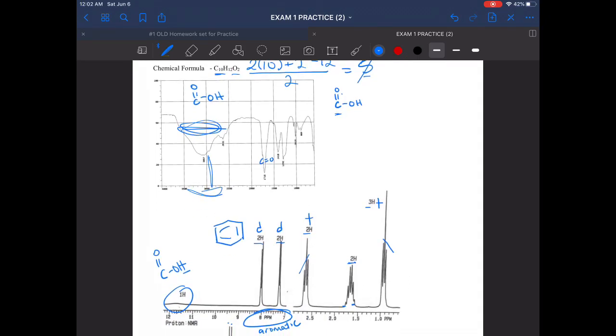So I'm starting to take down from my inventory. I also know that 4 hydrogens are on this ring. So it is a di-substituted benzene ring. I know that I have 4 aromatic protons. And if you listen to my lecture, this is actually a really, really nice, pretty example of a 1-4 substitution pattern. So there's something here and there's something here.